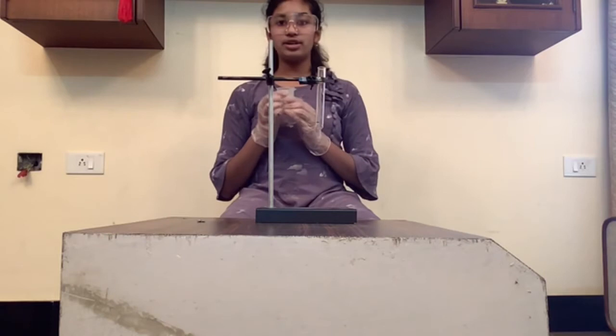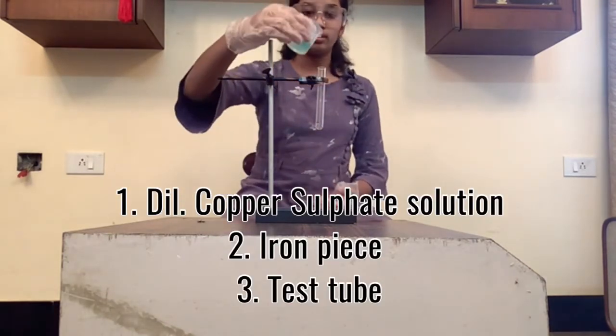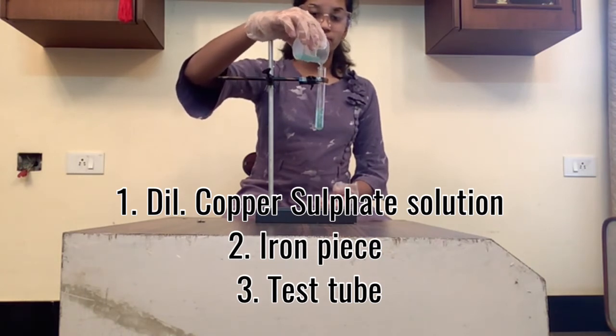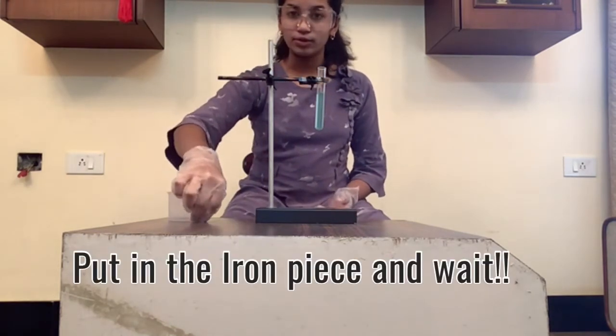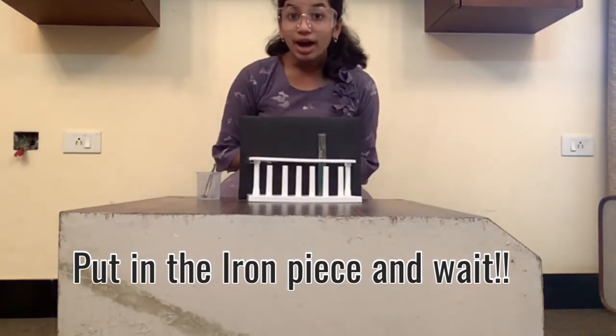For today's video I have dilute copper sulfate solution — I pour it into the test tube. Then I have a few iron pieces. I came back after a while and what I observe here is the solution has turned completely green.